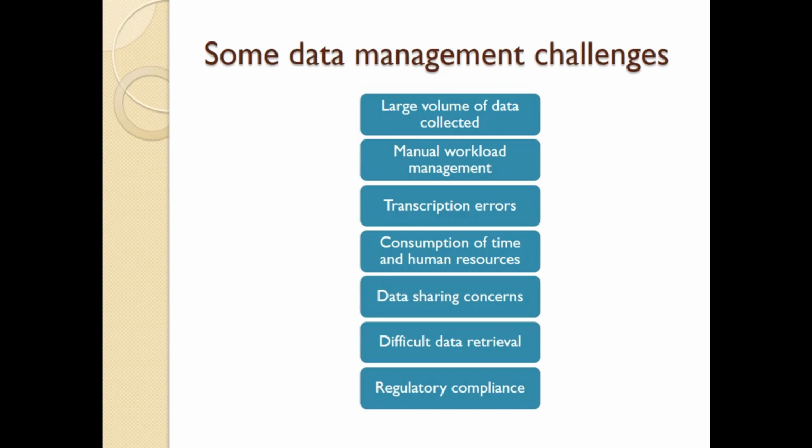Some of the challenges that we encounter routinely with managing data would be collecting large volumes of data routinely in the laboratory. So depending on how fast your batches are manufactured and the numbers that we sample and test in the laboratory, a huge amount of data needs to be managed after one particular run, for example. So that involves a huge manual workload. It involves a lot of transcription of data, both from sample prep into your logbooks or notebooks, as well as transcribing results from your outputs into maybe Excel spreadsheets or maybe into your logbooks or your notebooks.